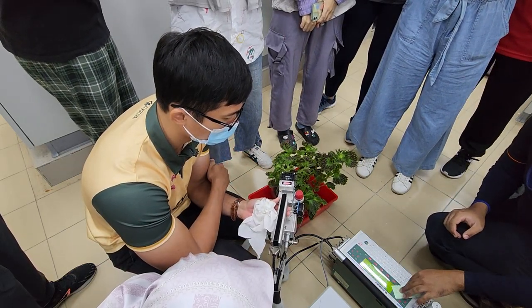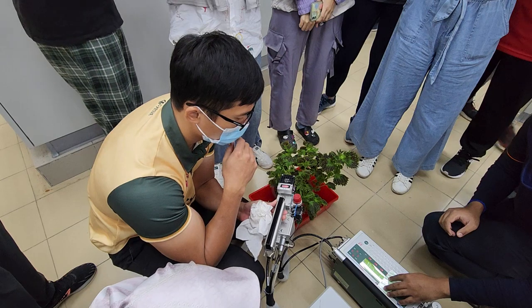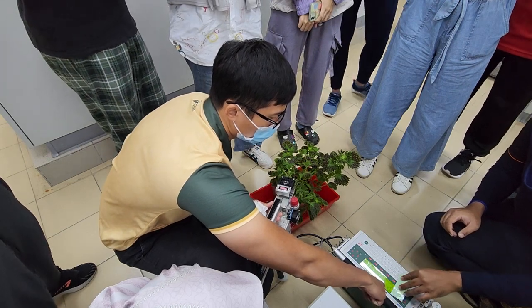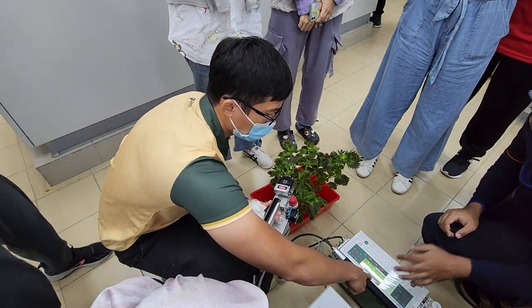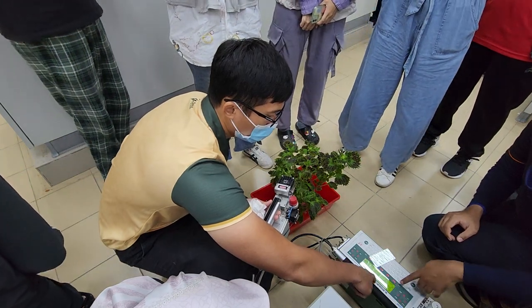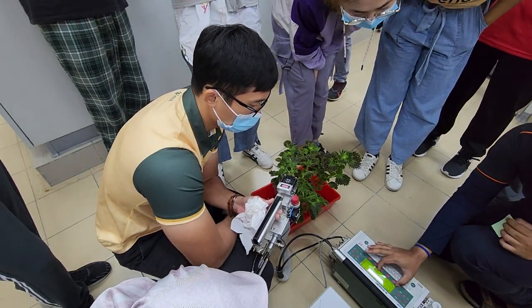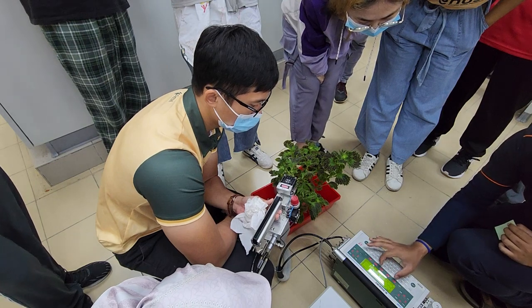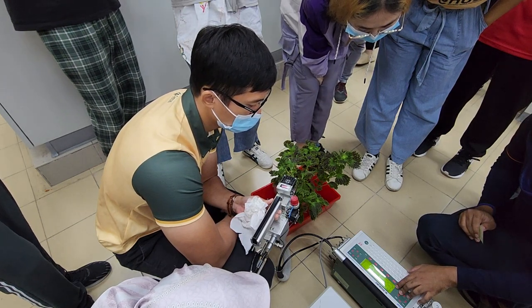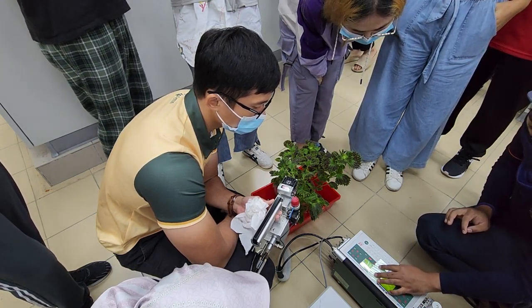This time frame is 2 minutes, maybe too long. So you close this. It does not indicate how many are open or closed. It indicates based on the water vapor passing through, validated by the pass rate. So that is very huge. The time frame gets shorter and shorter, the thing gets narrower and narrower. If you are very experienced, like for example this conductance, that is already stable.